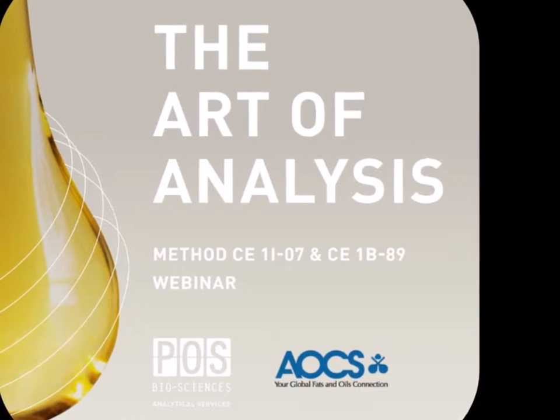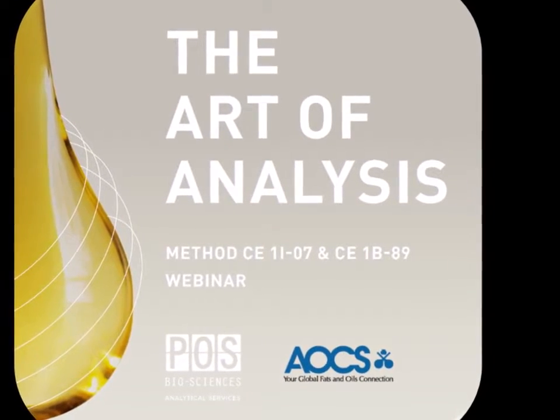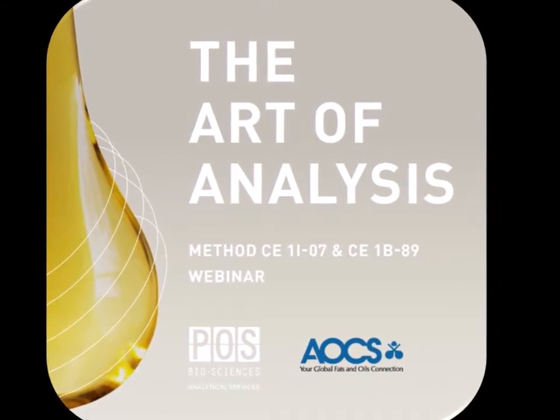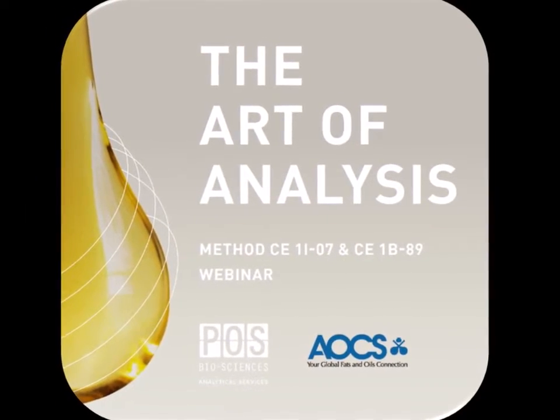With that introduction, we will start the video featuring the AOCS Ce 1i-07 and Ce 1b-89 methods.